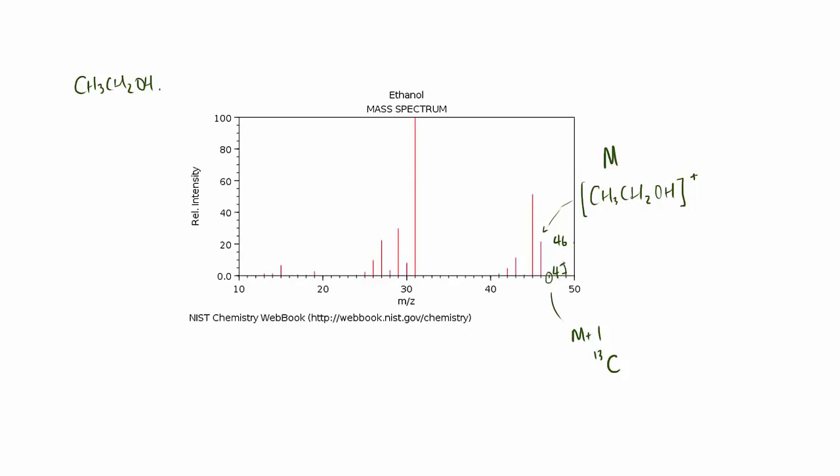And actually, in theory, you would find there may be a 48 there. It would be so tiny because that would require this to be carbon 13 and this. The chances of which doing are incredibly, incredibly slim. So if you could zoom in on here, loads and loads, you would find a tiny little peak there at 48, but it would be insanely small. This one at 47 is already small because of one being carbon 12 and one being carbon 13. Just thought worthwhile showing you a proper molecule.